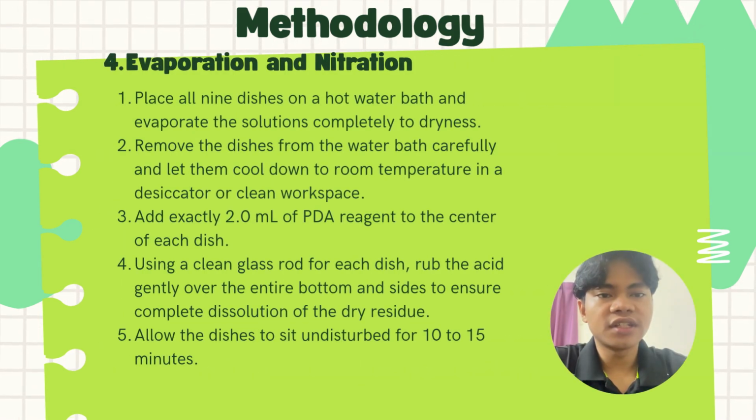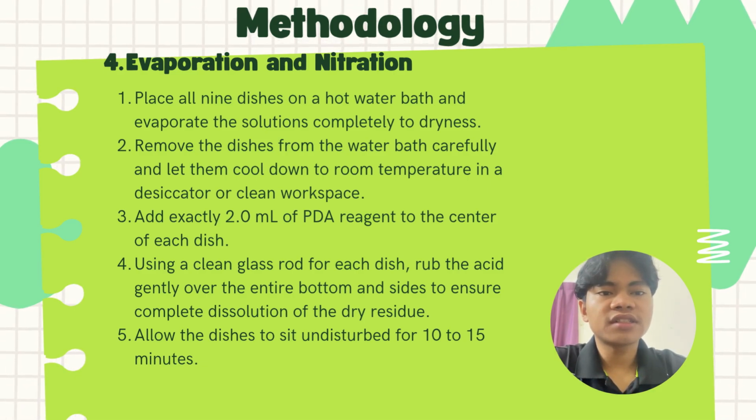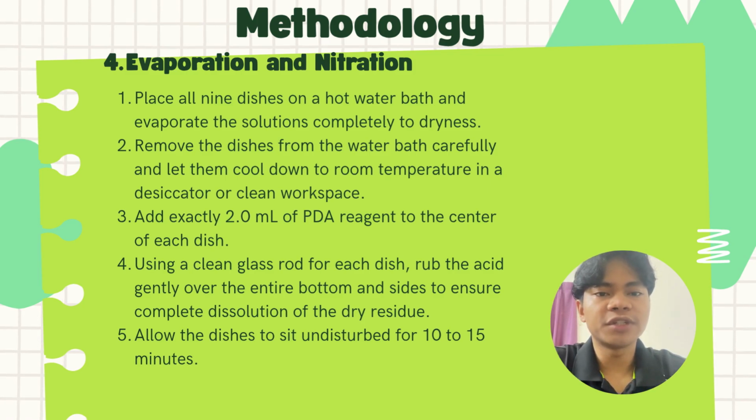Next is evaporation and nitration. All standards and samples were evaporated to dryness using a hot water bath. Once cool, 2 mL of PDA reagent was added to each dish. A clean glass rod was used to spread the reagent evenly so that the dry residue dissolved completely.